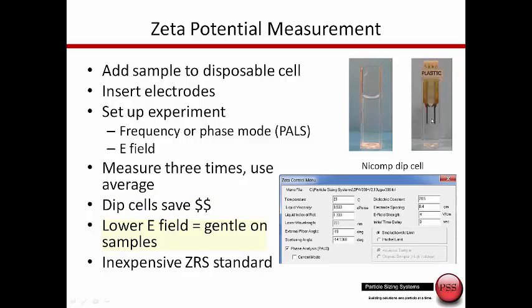These dip cells are the less expensive way to take the measurement compared to disposable cells because this dip cell will last for thousands of measurements over many years. We can work at much lower voltages because we're taking this measurement directly in between the electrodes. It's very beneficial when measuring biological samples because we reduce the joule heating and don't have to worry about baking the sample onto the electrodes. It's also better at high salt concentrations.